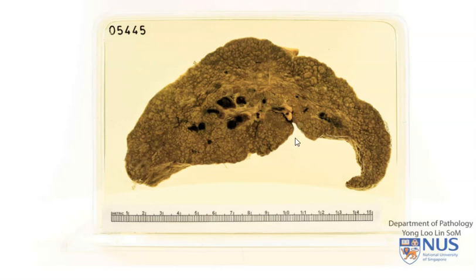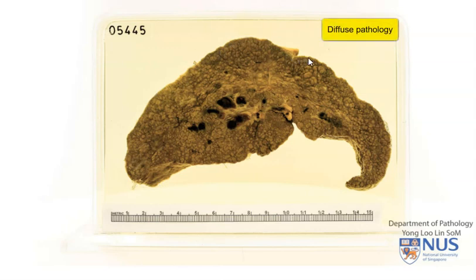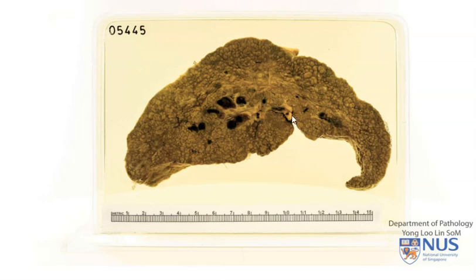Here is a slice of the liver, and this liver is grossly very abnormal. We can see that it is involved by a diffuse process that essentially affects the entire cut section. There are multiple nodules here that are replacing the entire liver. The other very obvious abnormality is the colour of the liver. In the fresh specimen, this would appear somewhat greenish, but it's difficult to appreciate in this preserved specimen.